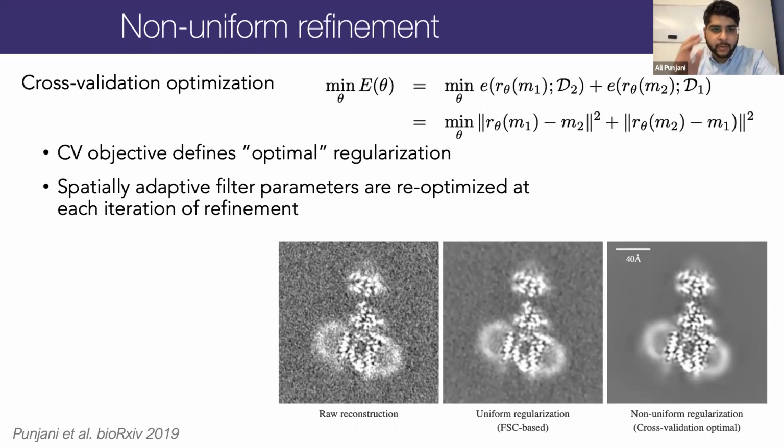It's saying that, you know what, there's something in the structure that I'm just going to pretend is not there when I'm aligning particles. And that's a very dangerous thing to do with a membrane protein, because the micelle itself, in terms of electron density mass, is very massive. For example, in this example, the micelle is a big fraction of the density of the actual thing that's in the ice. If you mask it out, now you're aligning a protein structure with no micelle to images that have something totally different in them, which is a protein structure with the micelle. And so it's very likely that the alignments will be totally wrong or get even worse because of that masking.